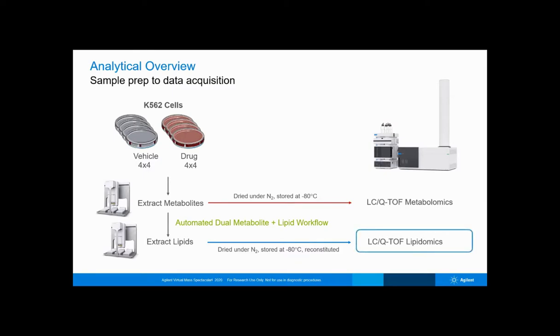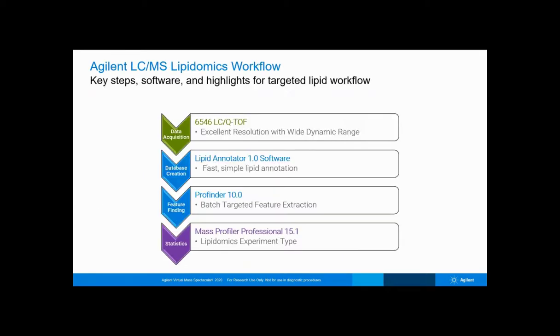And so I'd first like to focus on the lipid analysis with you, walk through that process, and discuss some of those results. This is just a high-level slide showing the major steps I'll describe for our targeted lipidomics workflow, and I'm just highlighting here some new features if you're already familiar with these products.